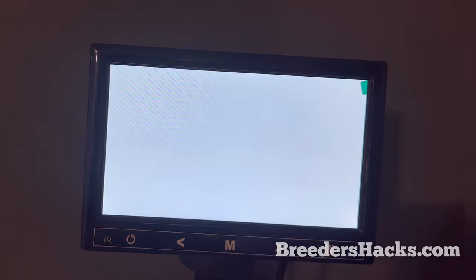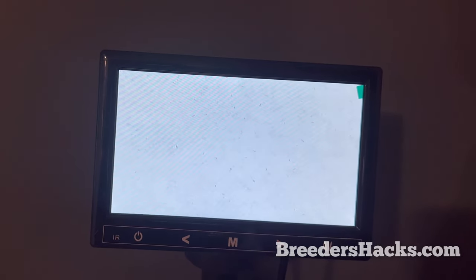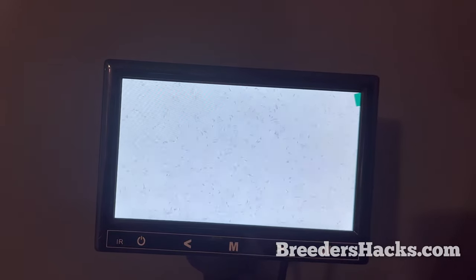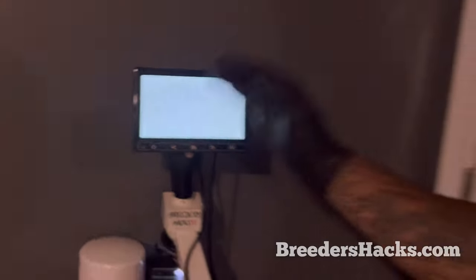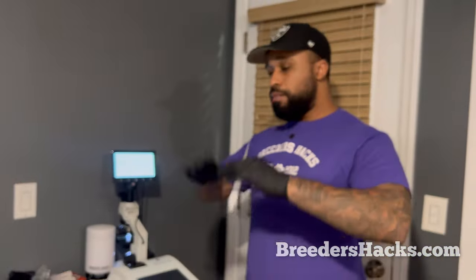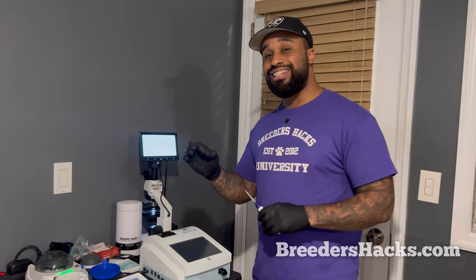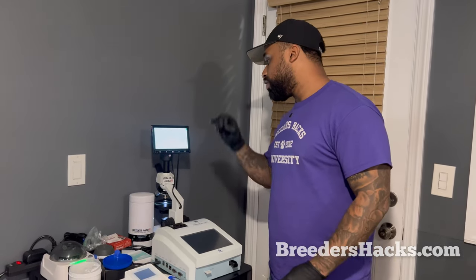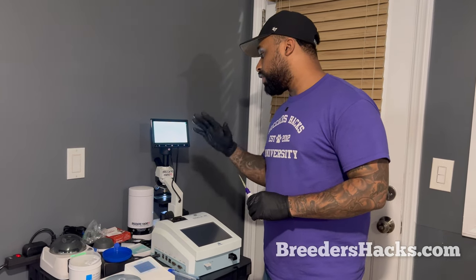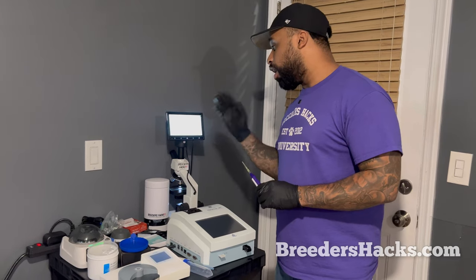Even if I move this slide, look at that. Let me just refocus. Sperm cells all over the place are moving, and I hope you guys can see this on the camera. But long story short, 3/4 of what you see on the screen needs to be motile and moving. And that's what's considered acceptable. So you wanna see at least 3/4 or 75% on the screen moving. This looks more like 90, because I don't really see any sperm cells that aren't moving.